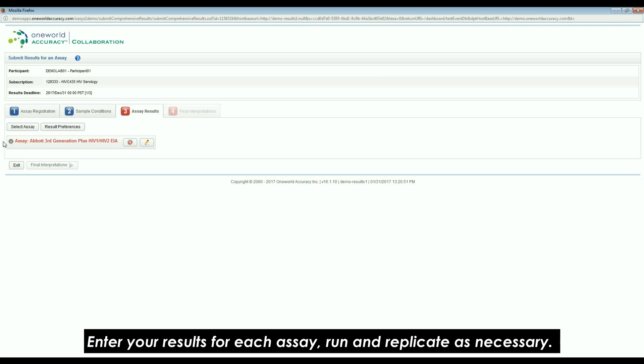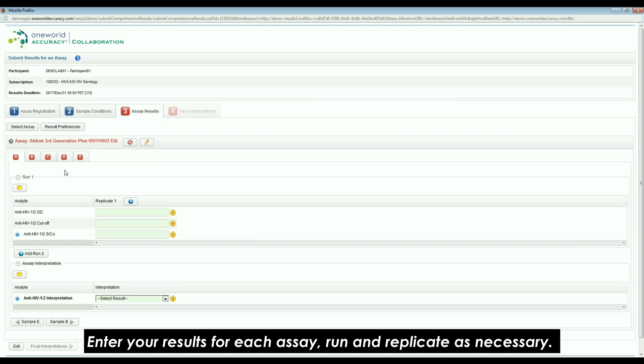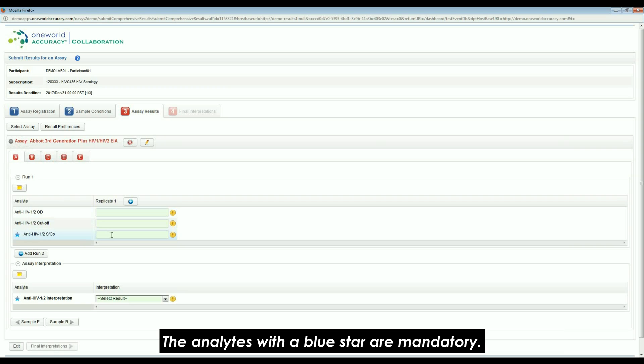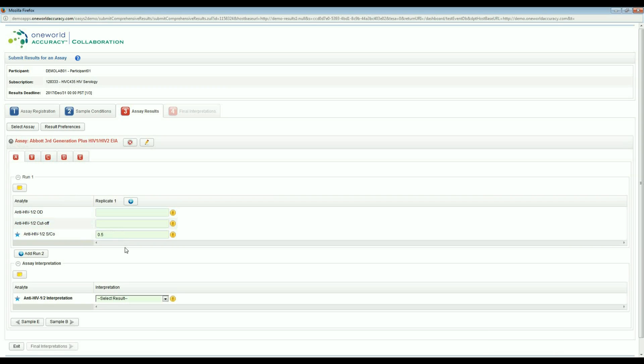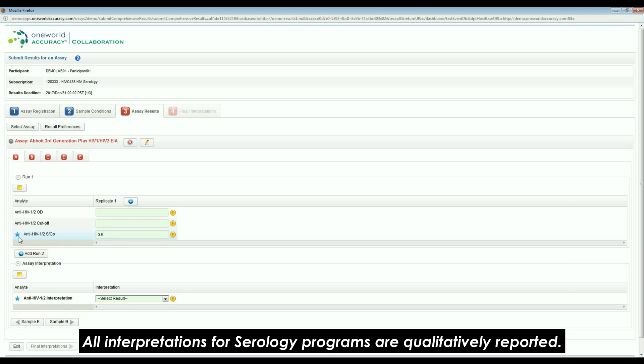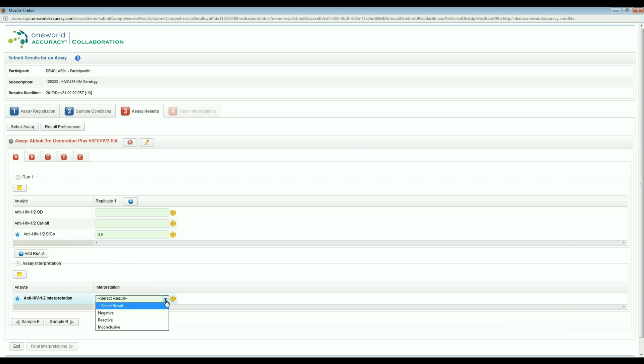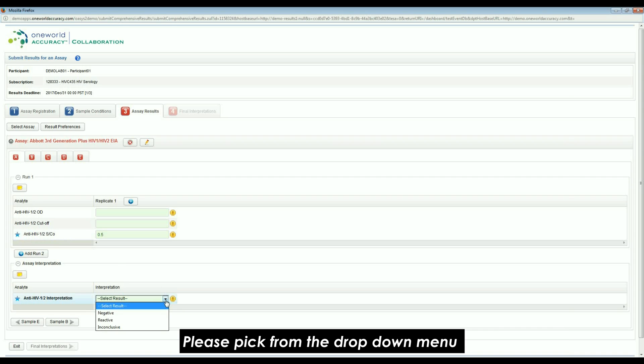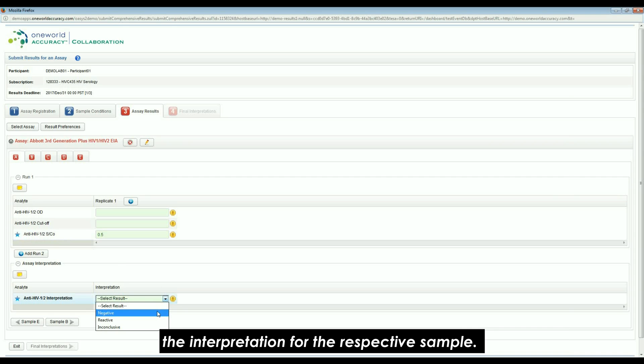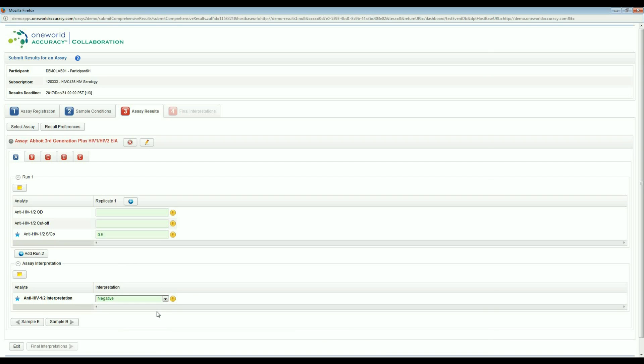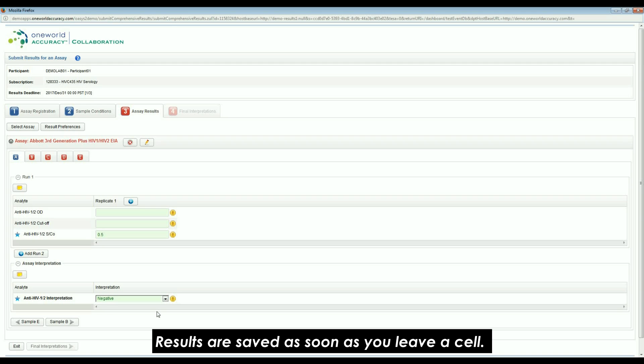Enter your results for each assay, run, and replicate as necessary. The analytes with a blue star are mandatory. All interpretations for serology programs are qualitatively reported. Please pick from the drop-down menu the interpretation for the respective sample. Results are saved as soon as you leave a cell.